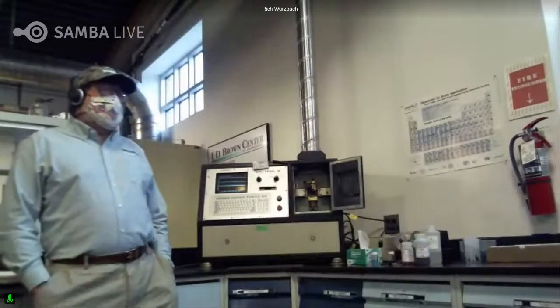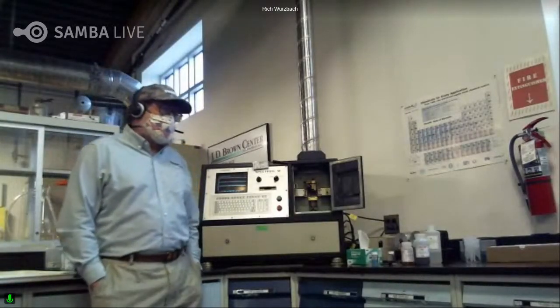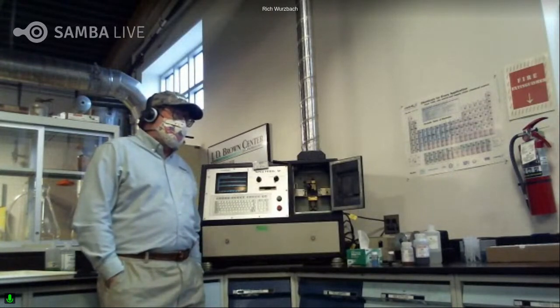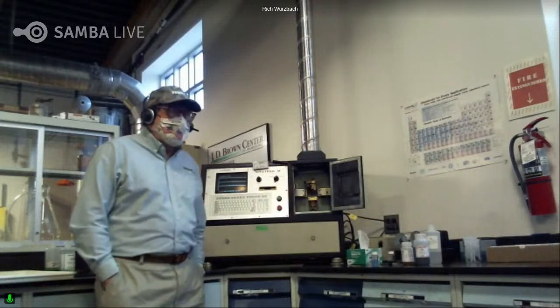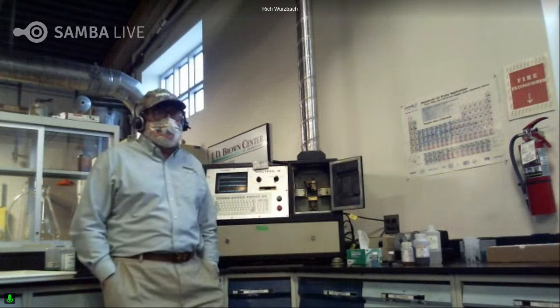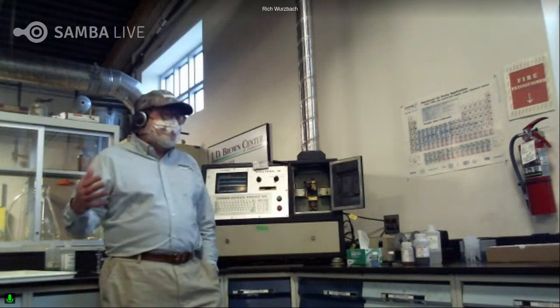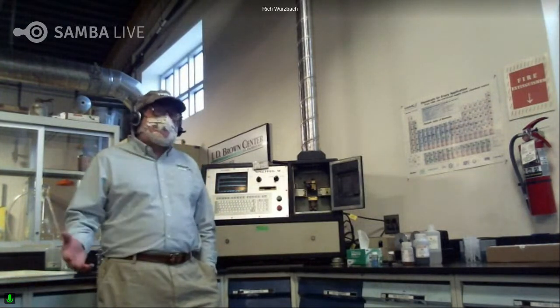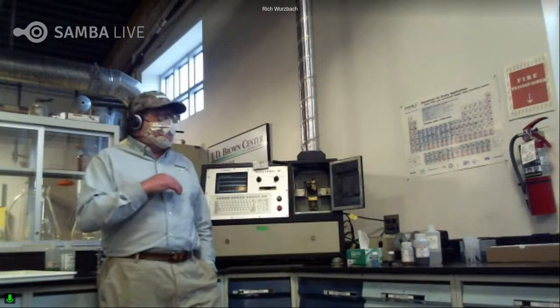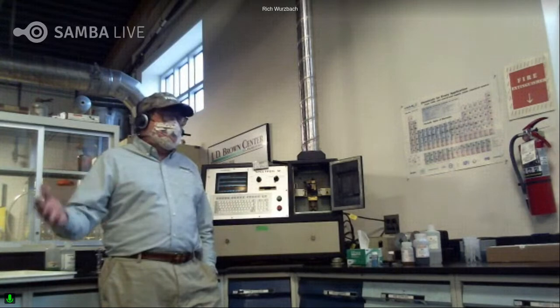I thought it was interesting that you selected the darker grease of the two, yet you didn't get much of a response on Spectro in terms of high elemental values. And it really underscores the importance of creating a broad test slate that looks at a lot of different parameters. Sometimes greases start very dark, or this could be strictly an organic degradation process.